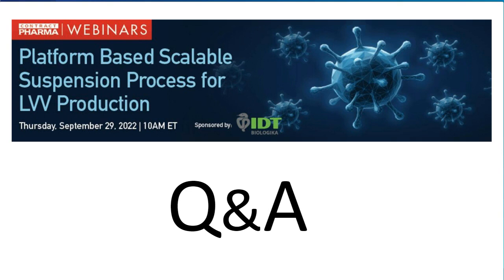Okay, great. Thanks, Ashley. Let's see. We got one more here before we wrap things up. Can you stick with a single functional titer assay, or is the expectation to do more? Yeah, we have an expectation to do more, like antibiotic resistance assays and those kinds of things, plaque assays. But currently, at our facilities, we are mainly focusing on the flow cytometry based assay.